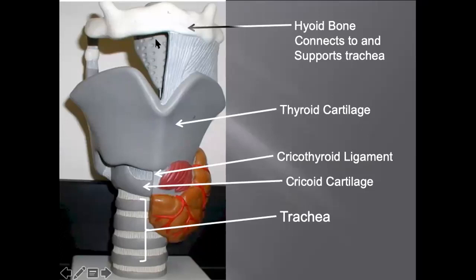The epiglottis is kind of hiding back in there. I'll get a better picture of that. Or yeah, I'd probably have to get a better picture. I don't see a good one on there. But the structure is epiglottis.